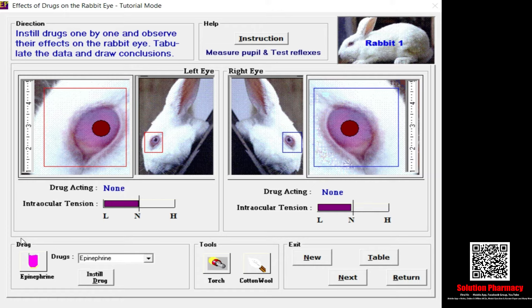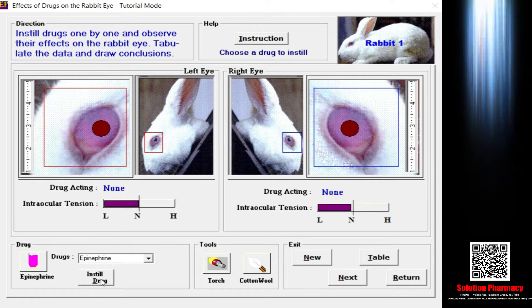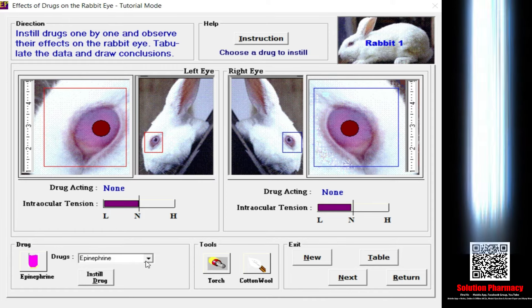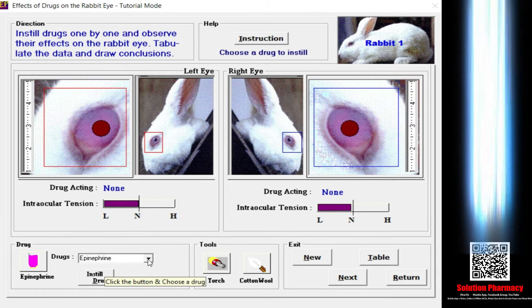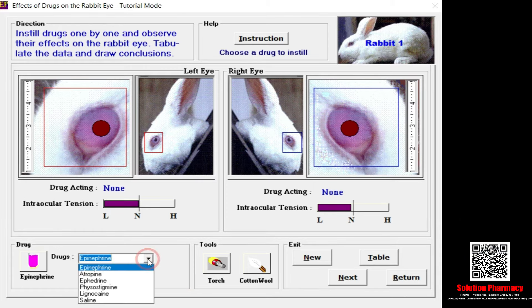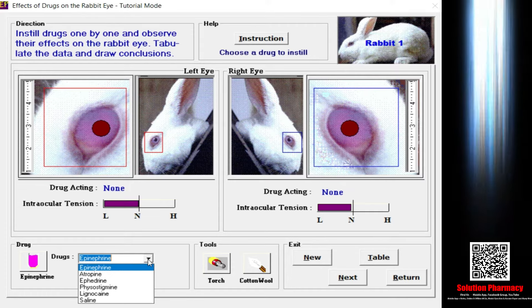The next tab is the drug selection tab. Here you can see an option for drug, and if you click the dropdown arrow you will find the other drugs listed: epinephrine, atropine, ephedrine, physostigmine, lignocaine, and saline.